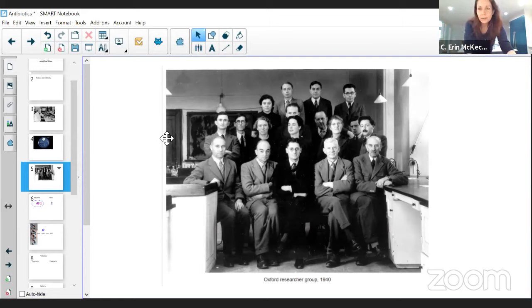So this was an incredible discovery, to be able to find a medicine in a type of mold and then give it to people and save lives. Incredible. Now, what I want you to do today is use bacteria and use antibiotics. And I'm going to show you why.